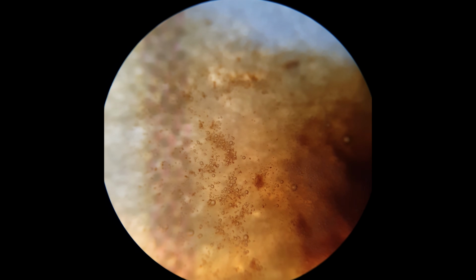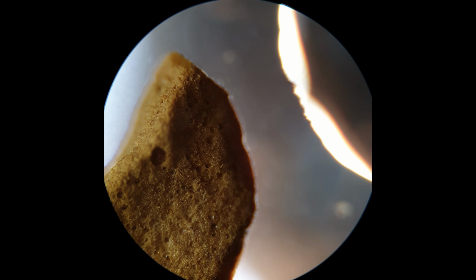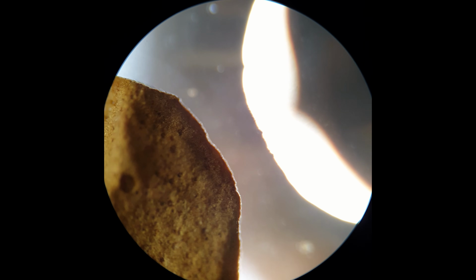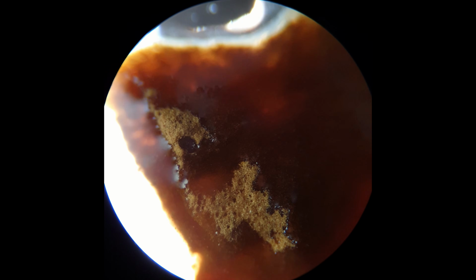Now we're going to look at this one more time, but without newspaper. Now what I have here is another granule of instant coffee, and that kind of shiny orb that you see in the top right, that's a droplet of water, and this is on a glass microscope slide. And what I'm going to do is push this instant coffee into the droplet of water. Now this is going to be super quick, so keep an eye out. Ready for it? Here we go. Boom. There we go.